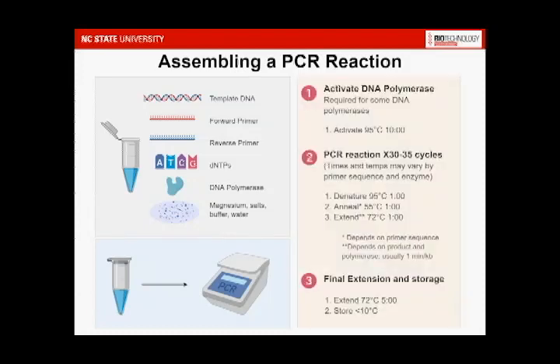Here's a good starting point for a typical PCR reaction. For most modern DNA polymerases, there's an initial activation stage that will activate the DNA polymerase and also helps to denature the original long template. In this case, I've shown this as a 10-minute incubation at 95 degrees.